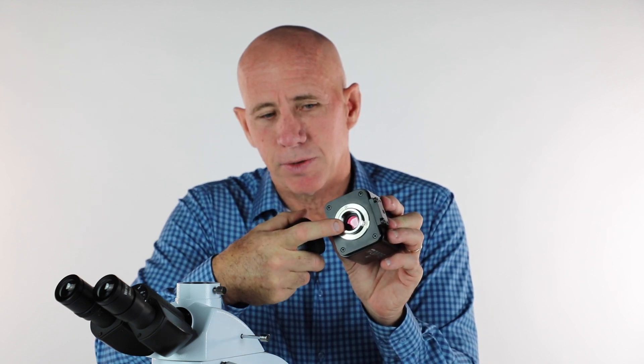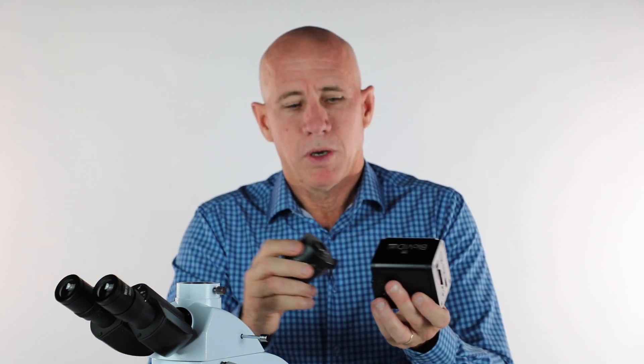Cameras have sensors, and they're all different sizes. Most of our cameras have sensors anywhere from a half inch down to a third inch. Inside the pipe is a lens, and what we're trying to do is project an image onto that sensor. With a 1x pipe, the image would project large onto a smaller sensor — that's like a cookie cutter, cutting out the middle third of the view you see through the eyepieces. But with a 0.5x lens, it tightens up that image so now you have the image fitting the sensor, and you're getting most of the field of view you would see through your eyepieces.